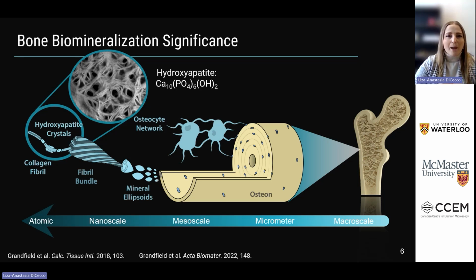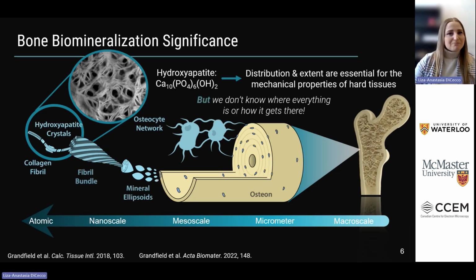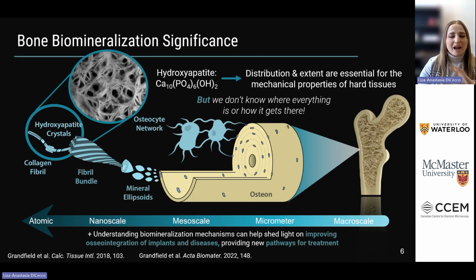Hydroxyapatite is our calcium phosphate mineral, and its distribution and extent are essential for the mechanical properties of hard tissues. But we don't know where everything is or how it gets there. And so that's a big theme to trying to explore these processes. Understanding these mechanisms can help shed light on improving osseointegration of implants and diseases, and provide new pathways for treatment.